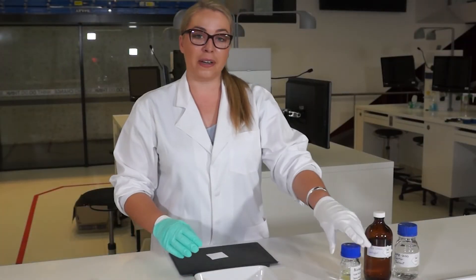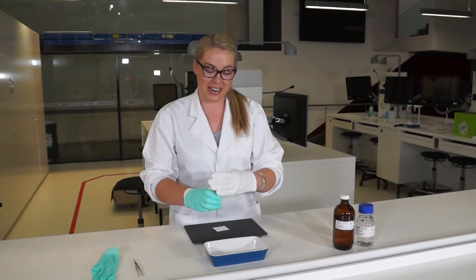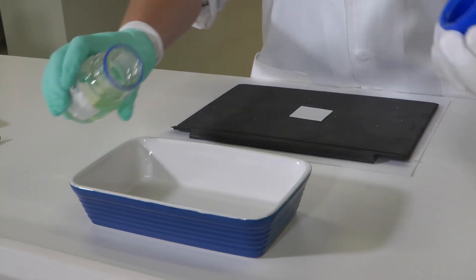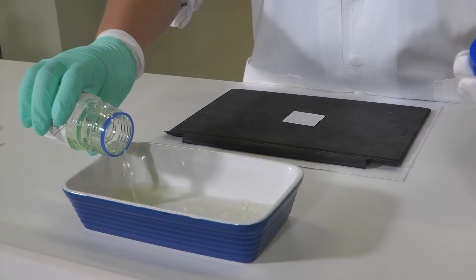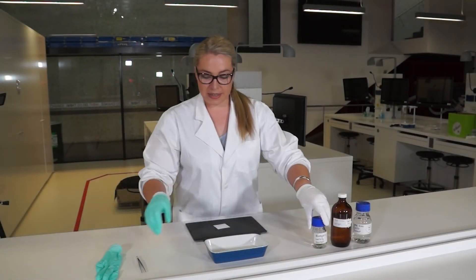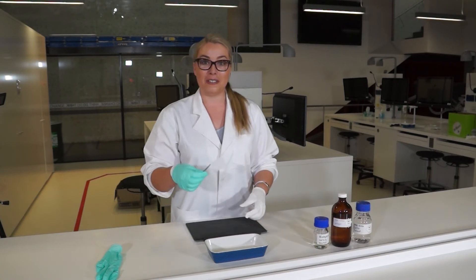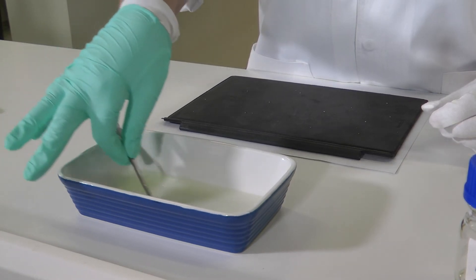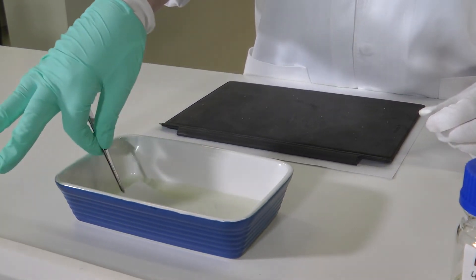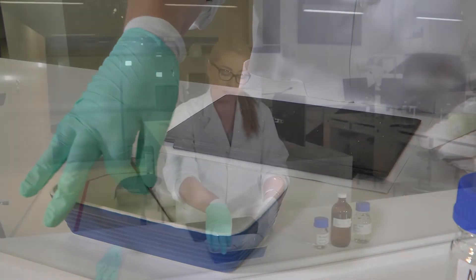To develop our sample we're going to put our ninhydrin working solution into our development tray. We're then going to take our sample using some tweezers so that the solvents don't eat through our gloves, and just swish it about in the tray. We only briefly immerse it because we just want the paper to be in there long enough to get a little bit wet.